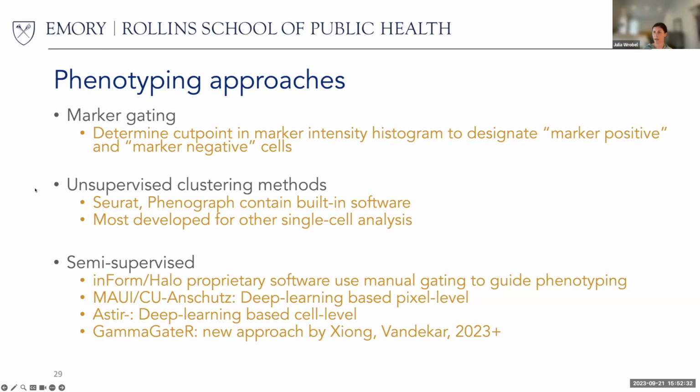Unsupervised clustering methods have been popular. Seurat and Phenograph are some that have built-in software. And most of these have been developed for other types of single cell analysis, not necessarily single cell imaging. And in those types of data modalities, the distributions tend to be more bimodal and less noisy. So those methods don't often work well for this data.